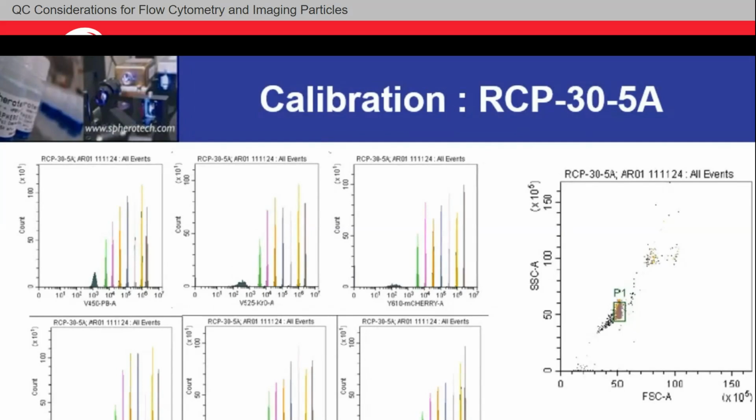Okay, so what I was getting to with this color-coded gating. If I'm running them and let's say I only see 5 peaks in a channel or 6 peaks in a channel, I might think, oh, I remember from the webinar, from readings, from publications, some of these peaks might blend. Maybe this is low resolution. Maybe this is the brightest peak. If I've color-coded them in every channel and I see the brightest peak is yellow, I know there's another peak missing.